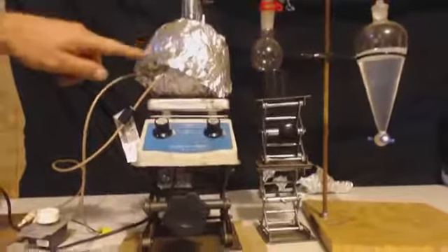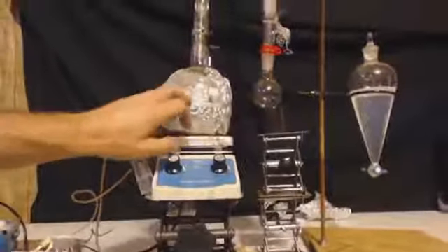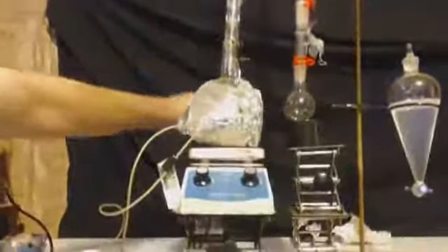Okay. This is my apparatus. I got everything, all that non-polar stuff inside there. My heating mantle. You can see I have a bigger column, goes straight up, 180 degree angle back down, goes to the condenser, and then a smaller round bottom flask. See there, where I'm going to collect everything.